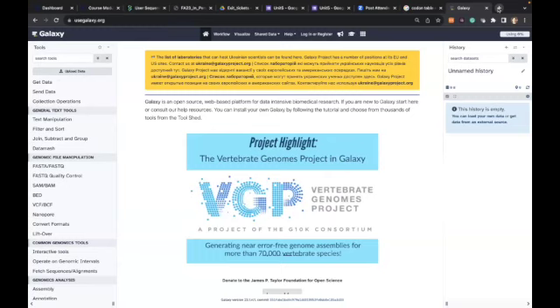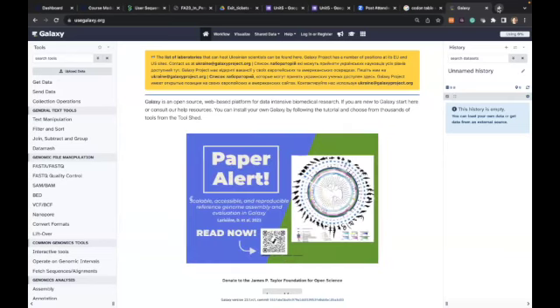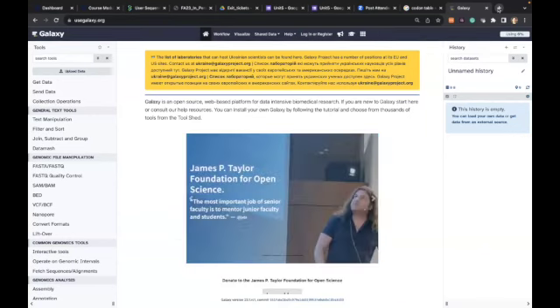Because you can easily scale. If it's just 5 samples, I'm happy to do it in Galaxy. That's fine, the result is the same. But I usually analyze 100, 200, or 1,000 samples. Then I don't want to click and wait for 10 hours and then come back and do another.